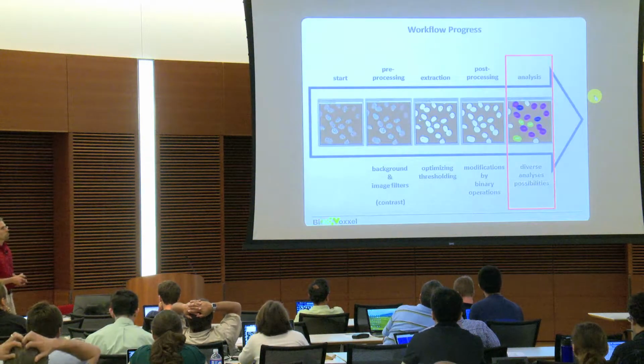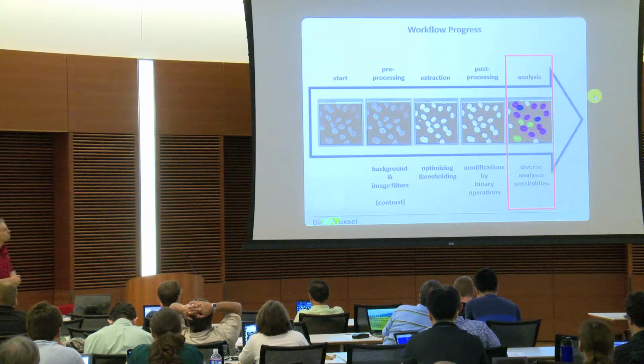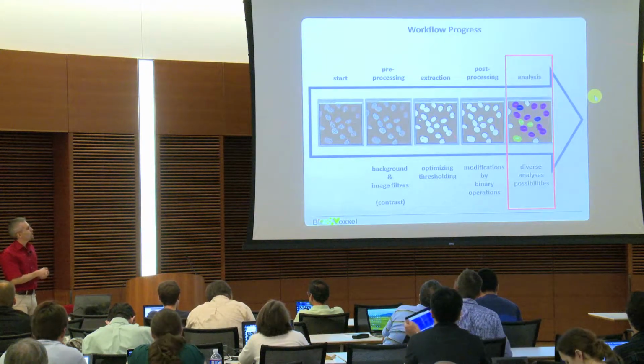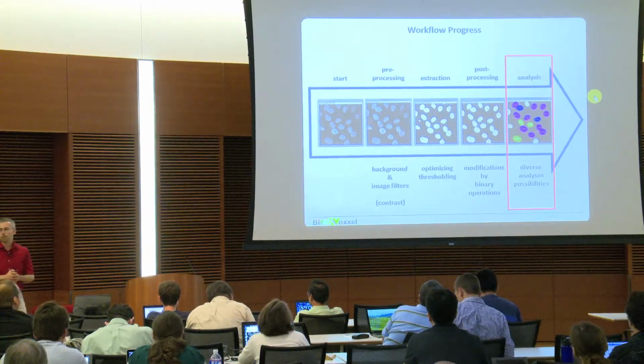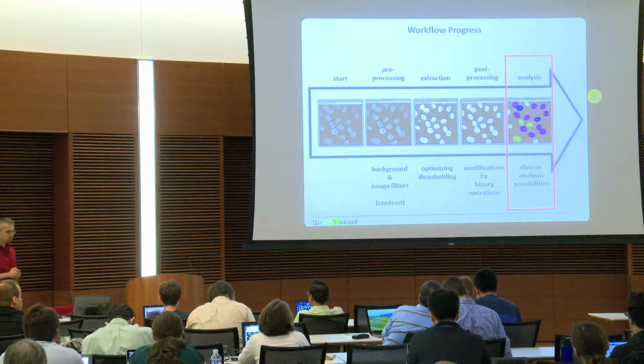So much for these modifications of binary images if necessary, which is not always the case, but if so, you see where you find that. Now we will rather have an eye on the analyses of those binary images.